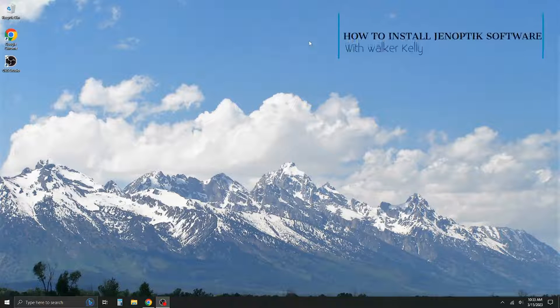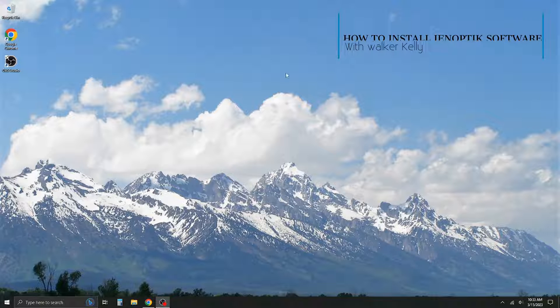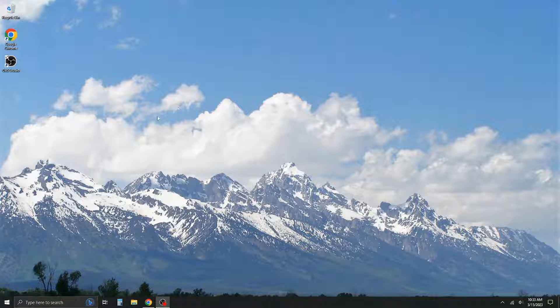Hi everyone, it's Walker Kelley with Monday Scientific Instrument Service and today we're going to go over how to install your Genoptic camera software.